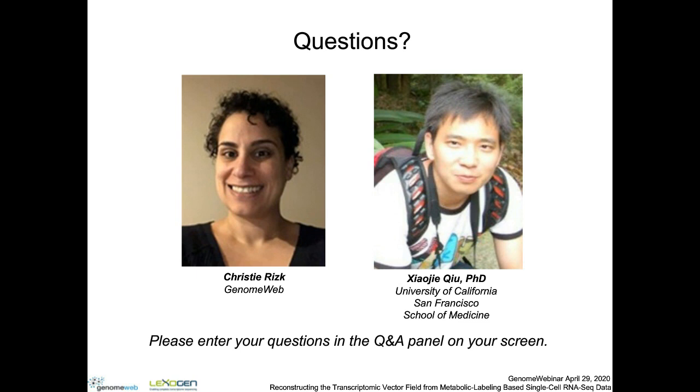the splicing rate. One thing I wanted to mention is that doing this for the regular 10x data or other types of regular single-cell RNA-seq data is difficult because we are just measuring the splicing. Since splicing is intrinsic, there is no way we will know how long the splicing process has happened. So that's why we use the metabolic labeling approach to explicitly model the time and to get the parameters with physical meanings.